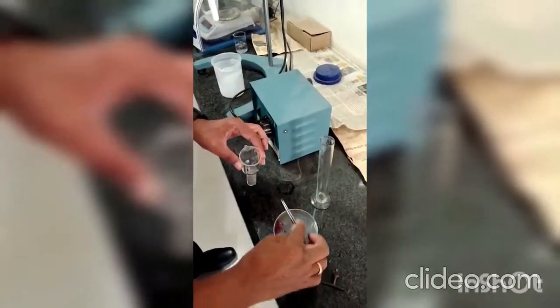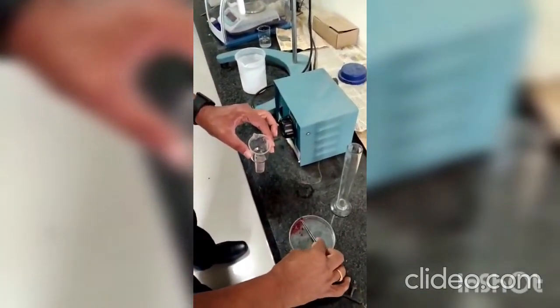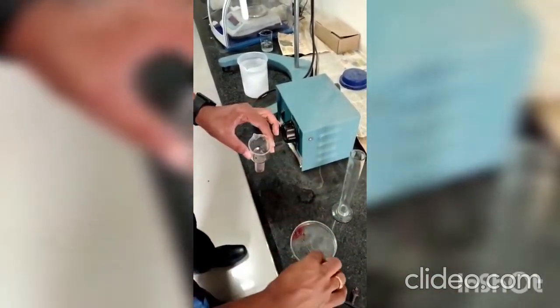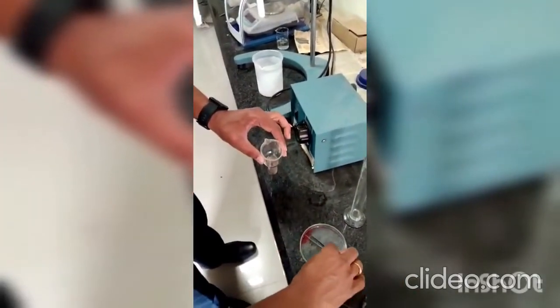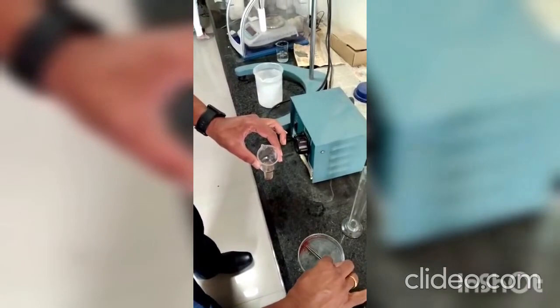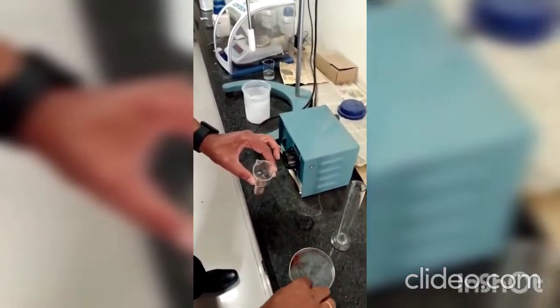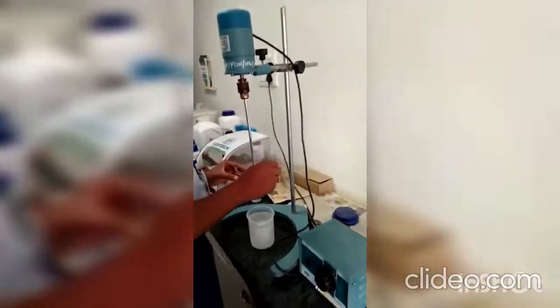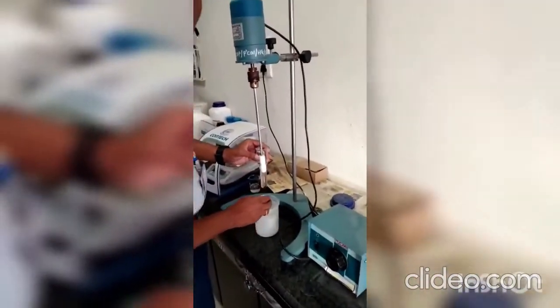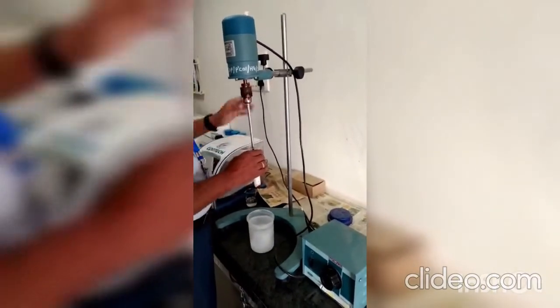In this process, a Potter-Elvehjem type homogenizer with a glass tube is used. The solution is prepared in the glass tube, then the shaft is inserted into the tube and slowly the speed of homogenization is increased.